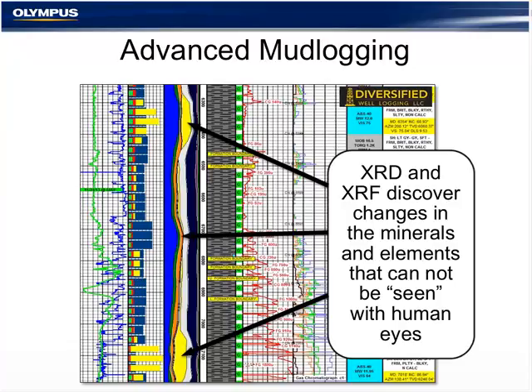So not only can the well cuttings and shales appear to look the same, but gamma and resistivity tools often aren't sufficient to recognize tough steering situations, such as lateral facies variations, a dip change, and fault throws. Especially XRF data can help here. With that widespread of elemental data from magnesium to uranium that can be obtained downhole from the well cuttings in often 30 minutes or less, along with a large set of elemental ratios, you can quickly gain a very comprehensive understanding of your position downhole. Okay. From here, I'm going to turn this over to Jose to discuss output data for ID and quantification.